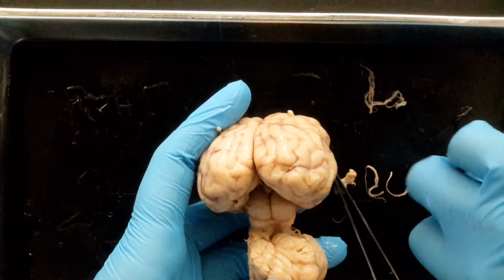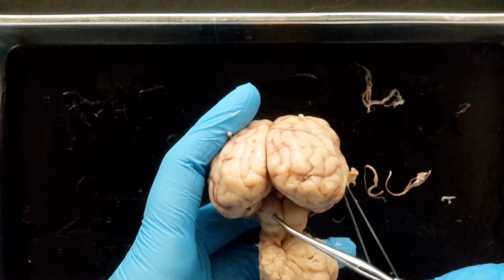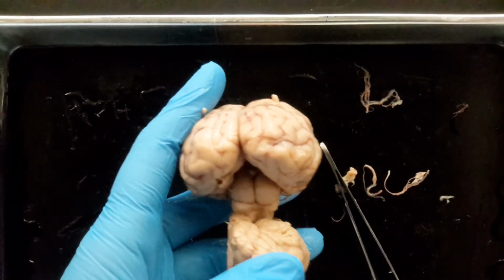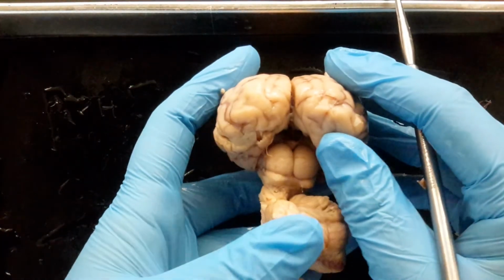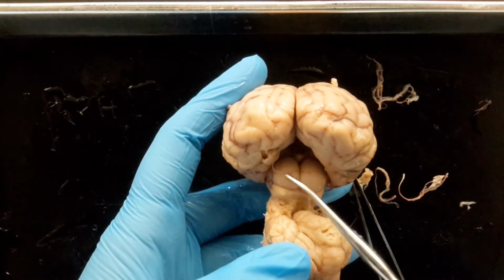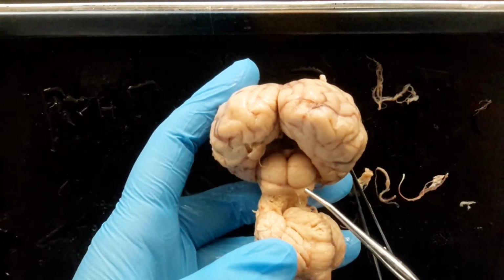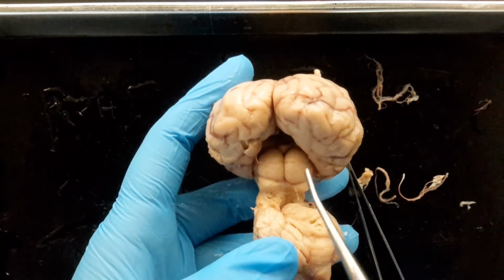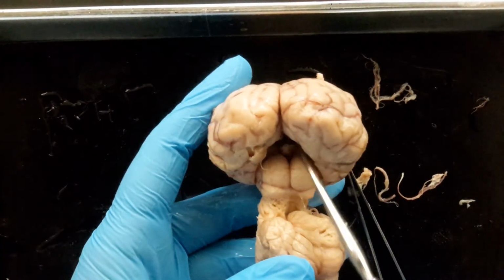So, external structures that we can look at. We have these two big bumps. You see those? Those are your superior colliculi. These two guys. The little bumps below, they're much smaller. Your inferior colliculi. And then right above your superior colliculi, there's a little tiny gland.